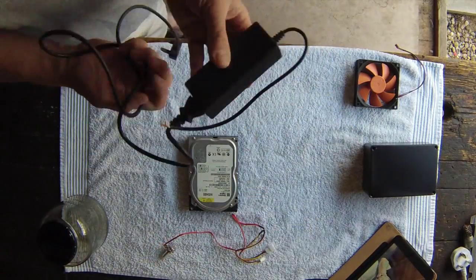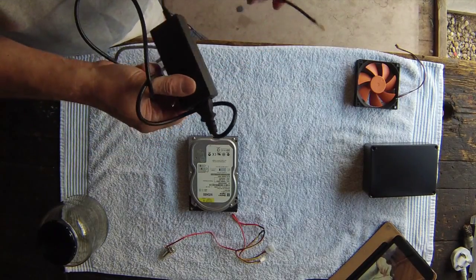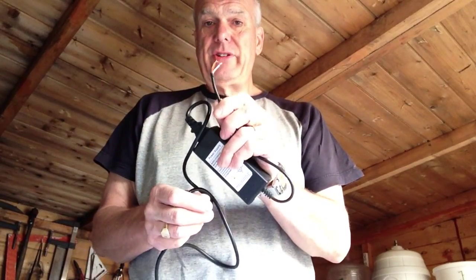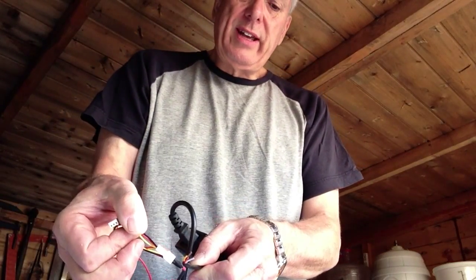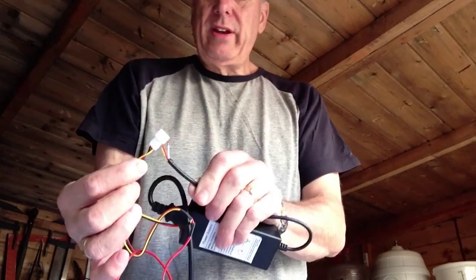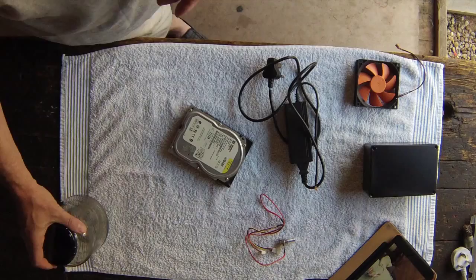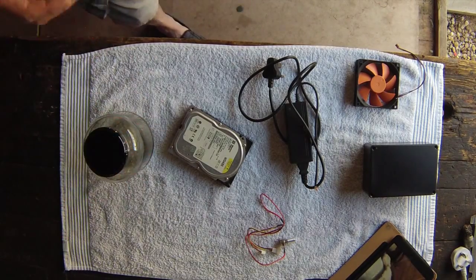I also had this from an old disk drive — it basically turns 240 volts into 12 volt direct current. I've cut the lead off to see what colours the wires are, which should match up with the colours on the controller. And I needed a magnet — apparently you can get magnets out of one of these old hard drives. This one is about 40 gig, which isn't a lot nowadays.